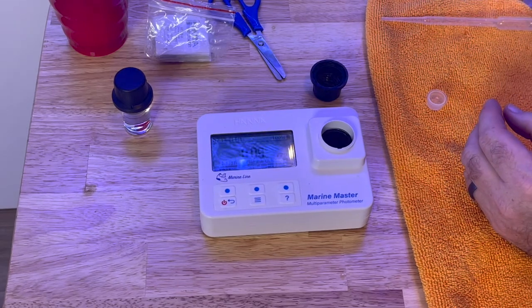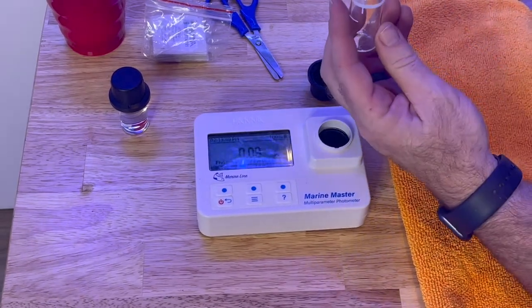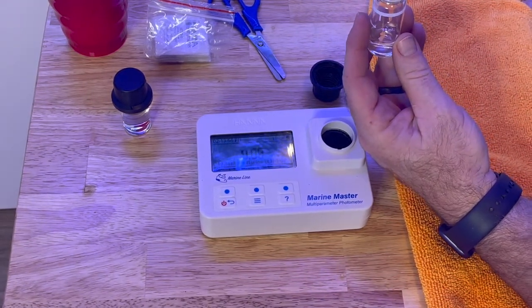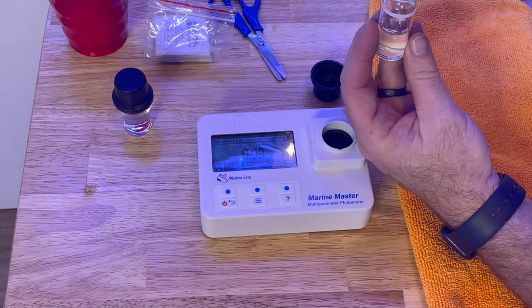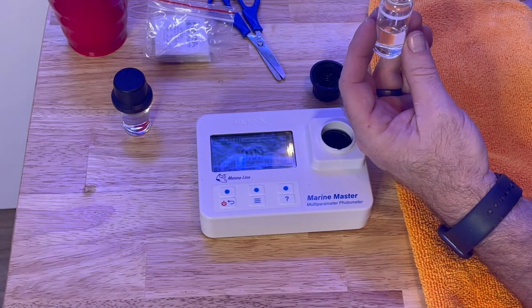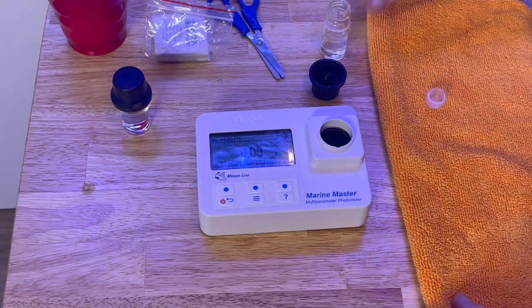I'm going to pour that out into the cup and clean my cuvette with some tank water, shake it around, and do that a couple times because I don't want any of the reagent from the phosphate test messing up my nitrate test. I'll put a little more water in, shake it again, and pour it out. Now I'm going to fill it up to the 10-milliliter line — I think it takes about four pipettes, approximately. I'll run that test and you'll see what my nitrates are. Last time I checked, they were just under 14, like 13.6 or 13.8.